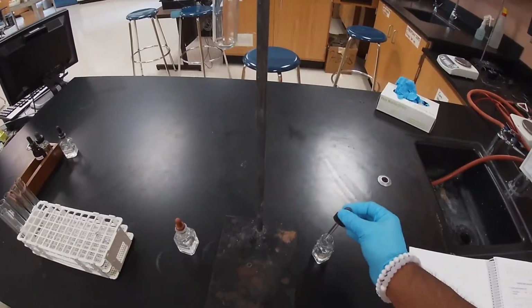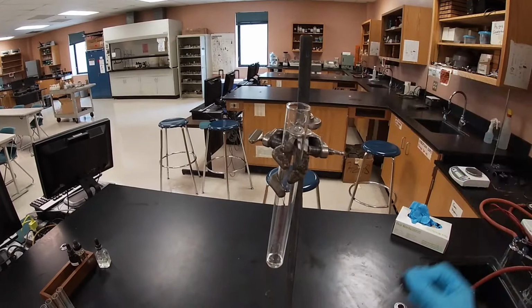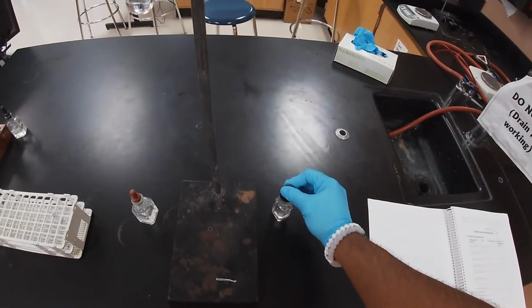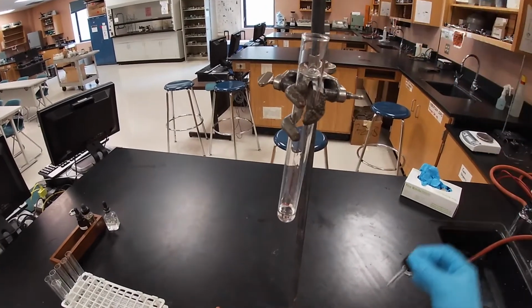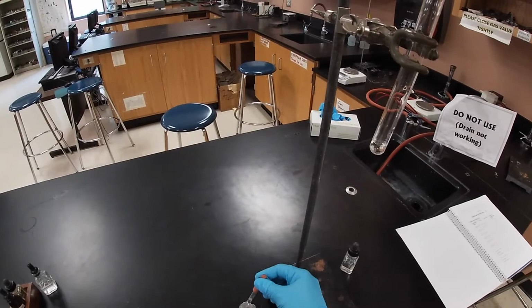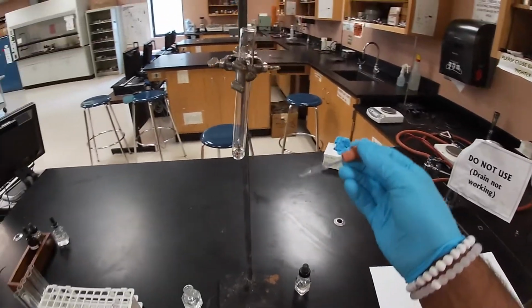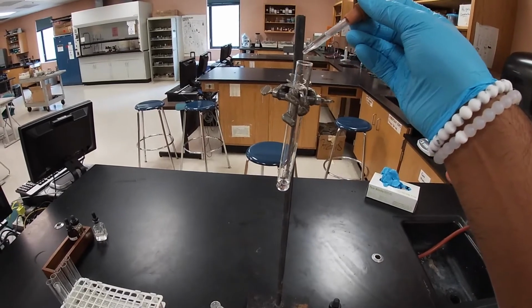We're going to get a dropper full and add it to our test tube. Let's get another one. Now we're going to get a dropper full of our sodium phosphate, and add it dropwise.